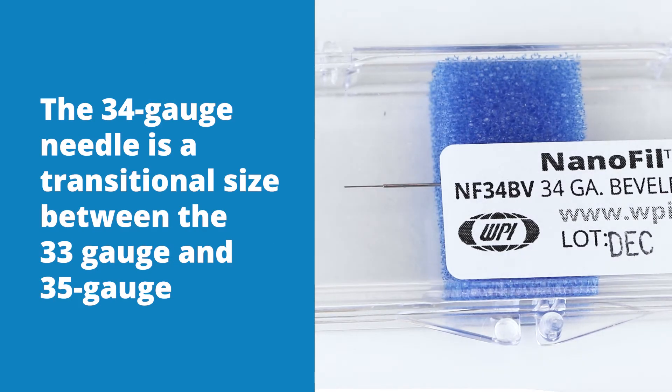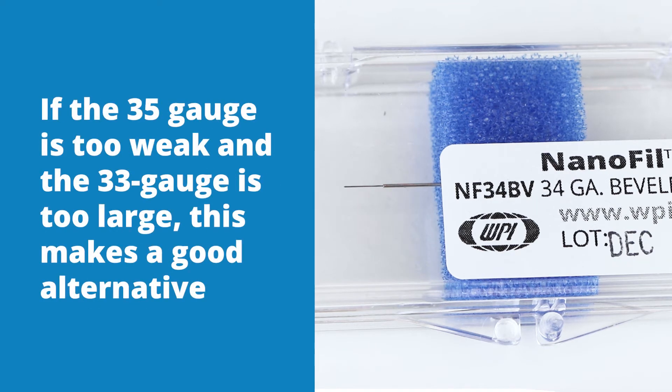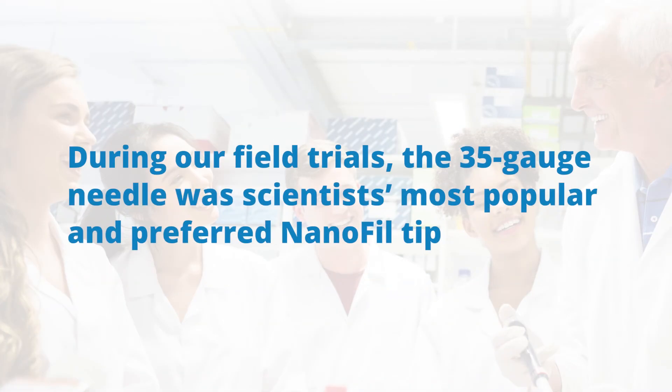The 34 gauge needle is a transitional size between 33 and 35 gauge. If the 35 gauge is too weak and the 33 gauge is too large, this is a good alternative. During our field trials, the 35 gauge needle was scientists' most popular and preferred Nanofill tip.